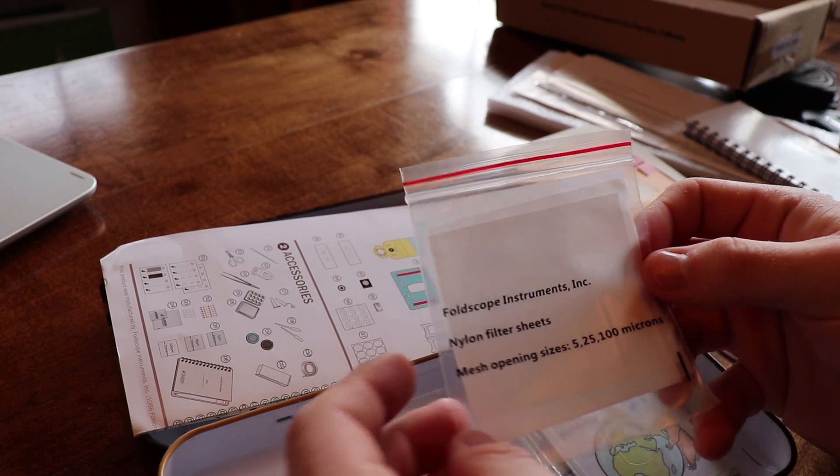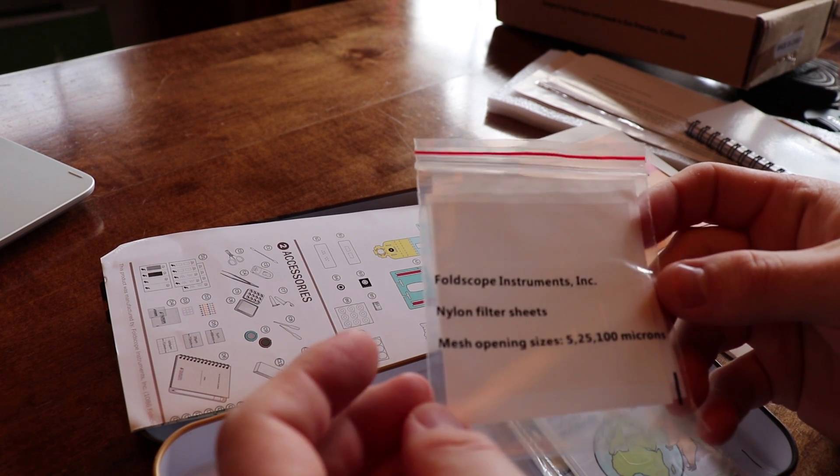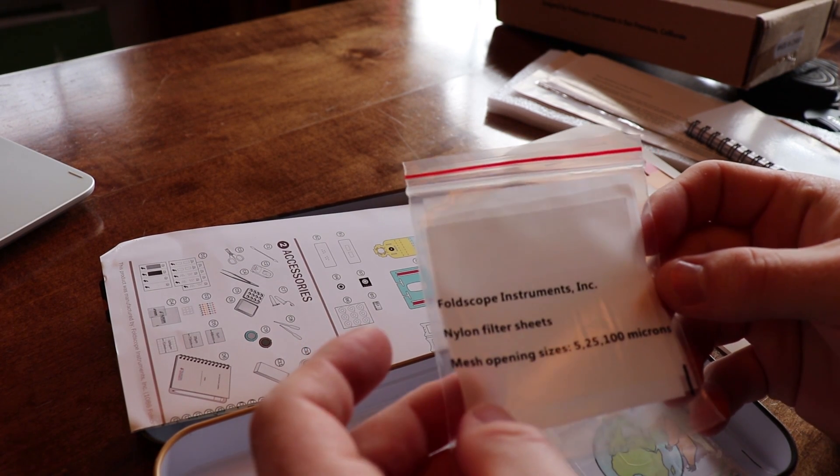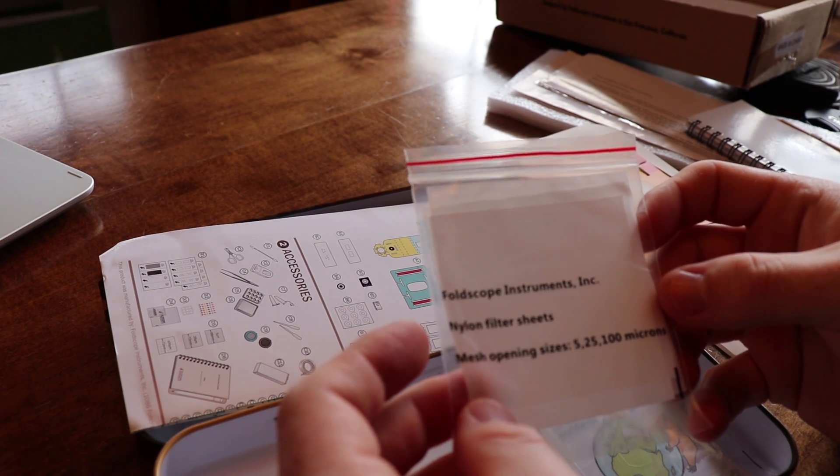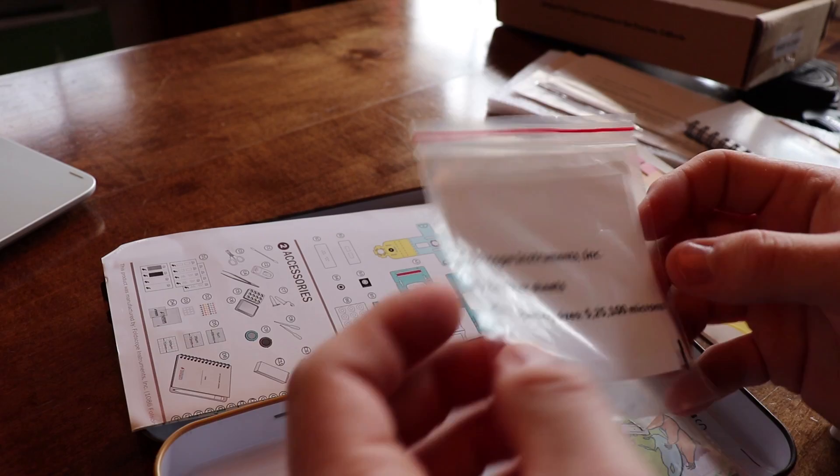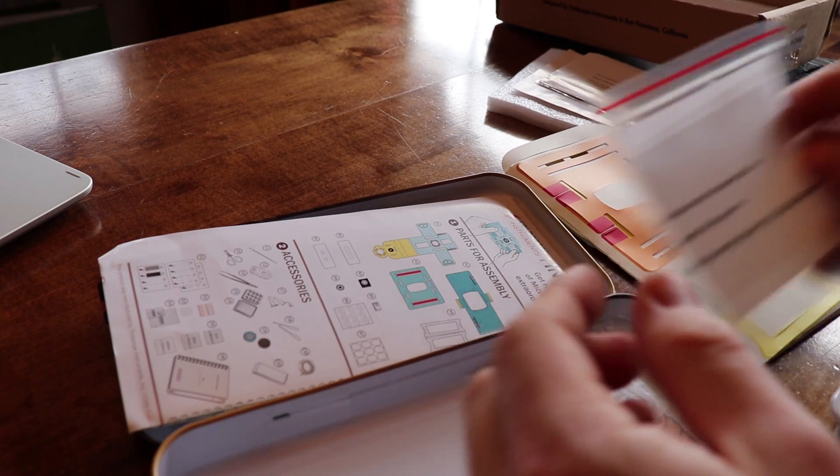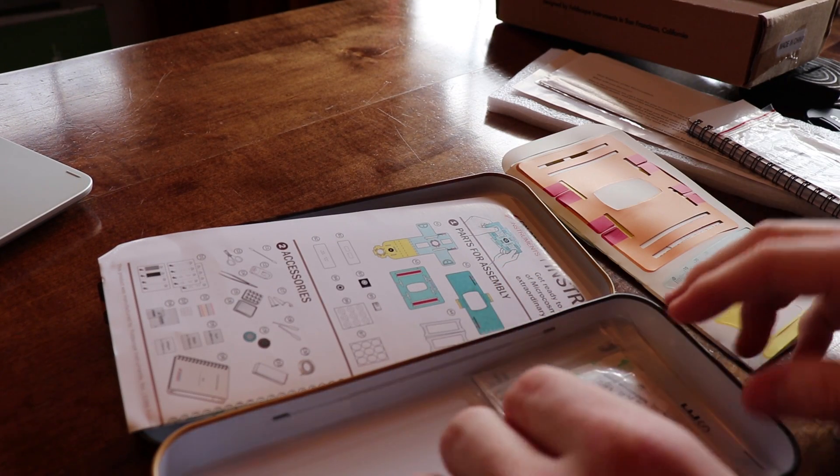Assuming they're still making them and stuff. Nylon filter sheets. Mesh opening sizes 5, 25, and 100 microns. That's crazy. Okay.